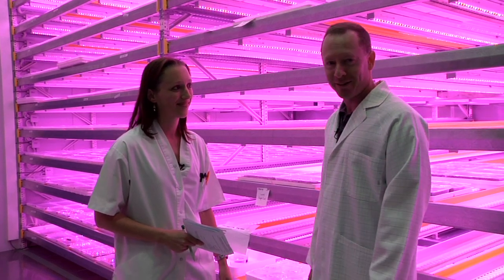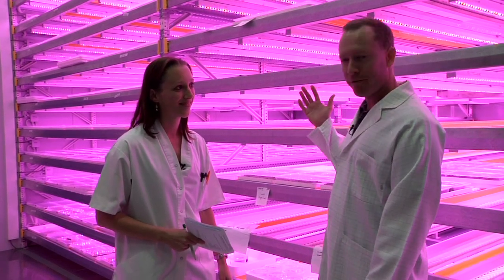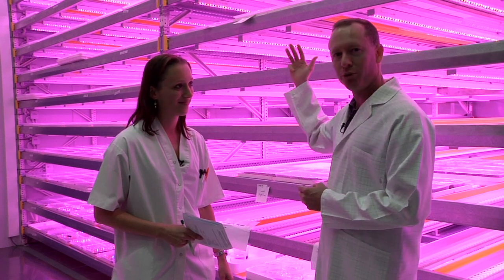Now we're here with the LEDs — the light emitting diodes. This is an area of research and interest where greenhouse growers, especially in America but also in the Netherlands and other parts of the world, are interested in this new technology.